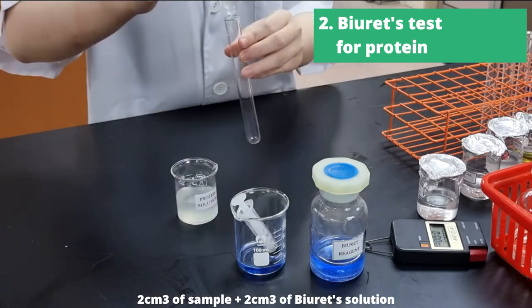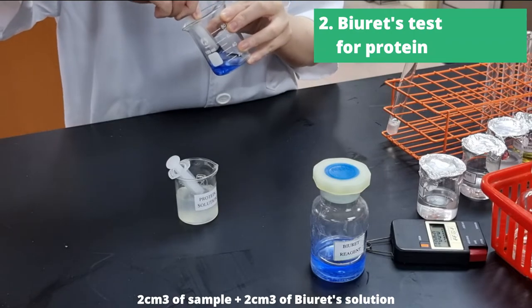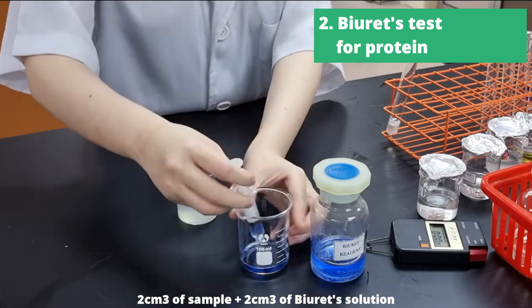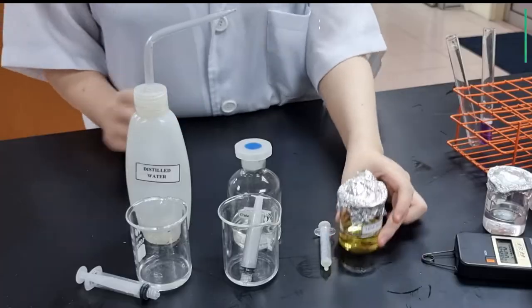Now while it's boiling, we'll be moving on to Biuret's test. We're going to add 2cm³ of sample and then add 2cm³ of Biuret's solution into the test tube. And when that's done, that will give you a purple solution.